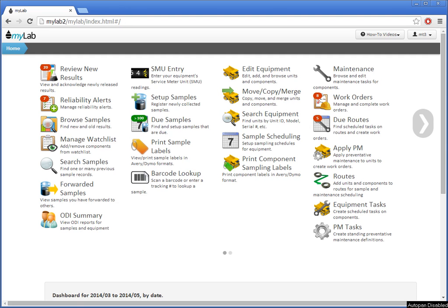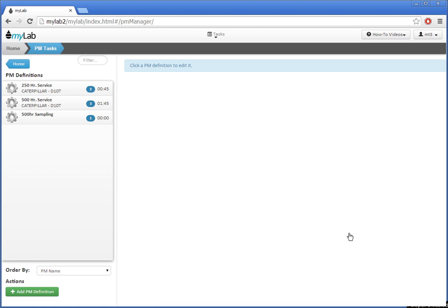Hello. In this video, I'm going to show you how to define preventative maintenance tasks using FluidLife's myLab. First, I'll select the PM tasks from the myLab homepage. Now, I'll press the Add PM Definition button here.